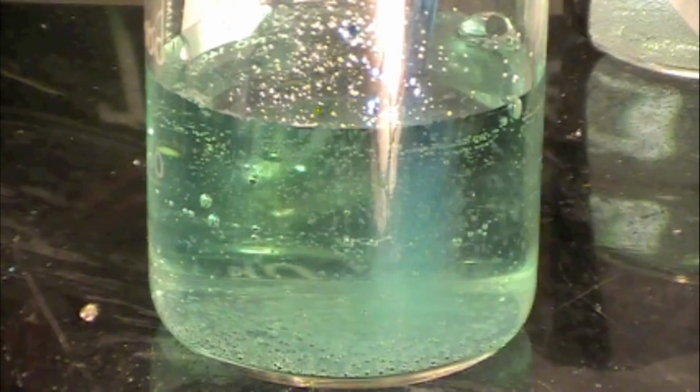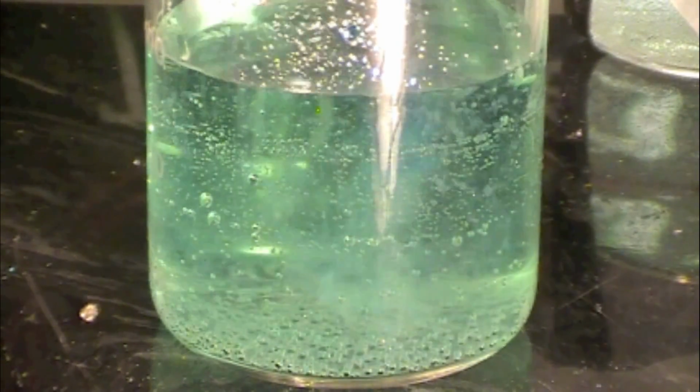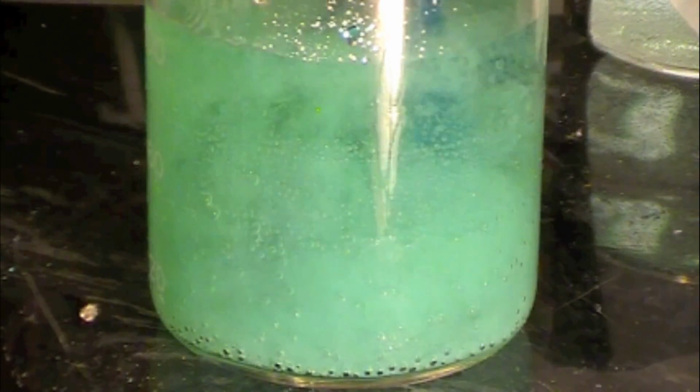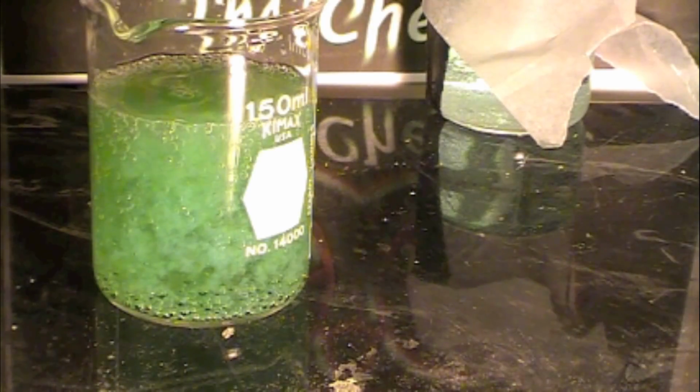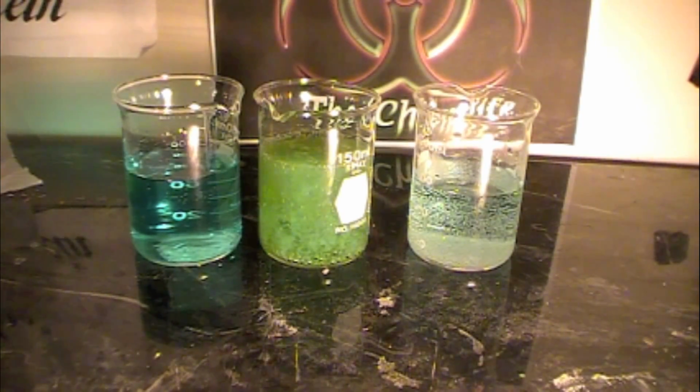It isn't evident immediately, but after a certain concentration of cellulose is present in the solution, you can see a massive amount of cellulose forming. So here is the finished cellulose solution, and here's a comparison between the three acids. You can see the only one that really worked well was the sulfuric acid.